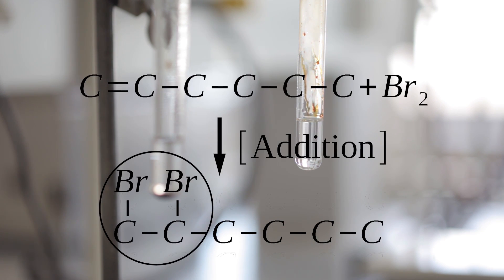Now you can see that the addition of bromine to hexine results in one clear phase.